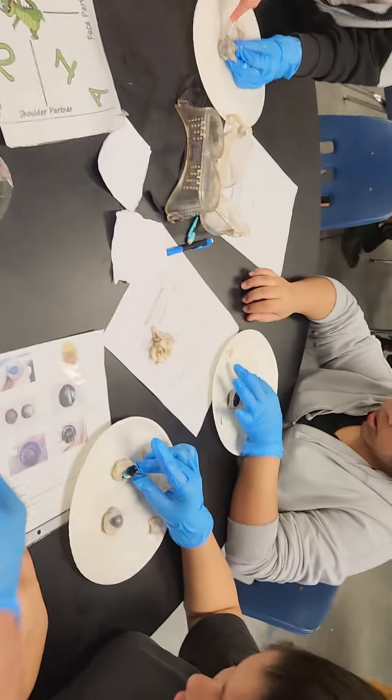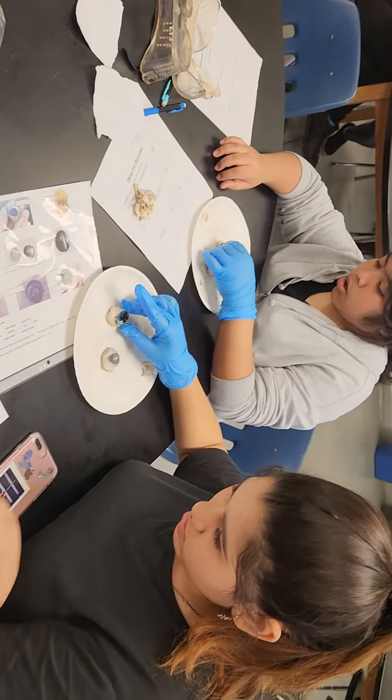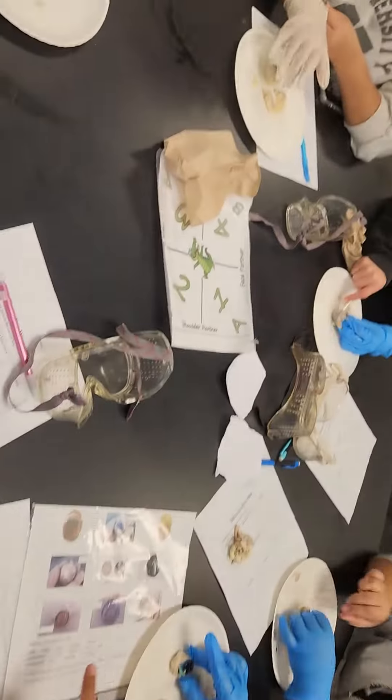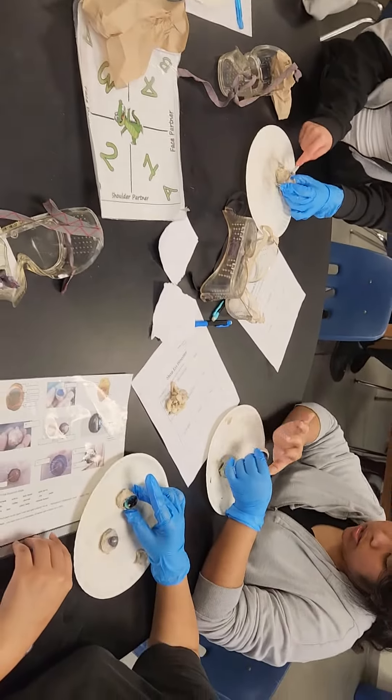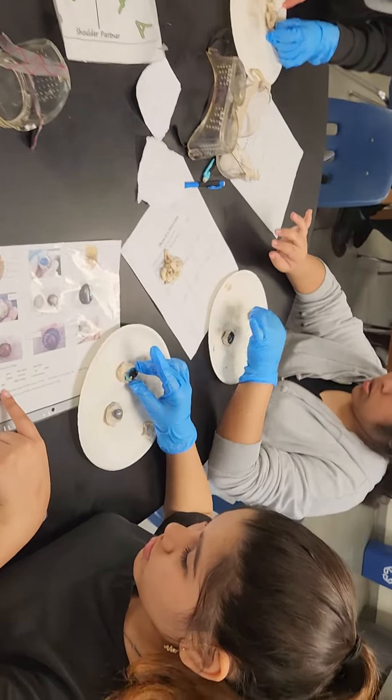Sends it to the optic nerve? So what part sends it to the optic nerve? It's either the pupil or the lens. Not the pupil — pupil and lens are on the other side.